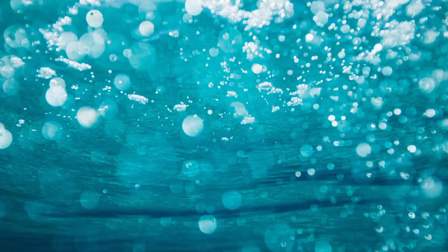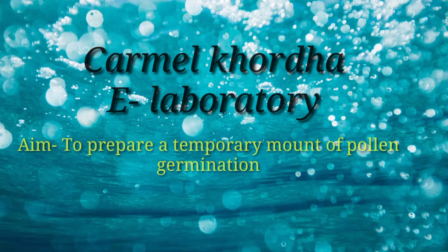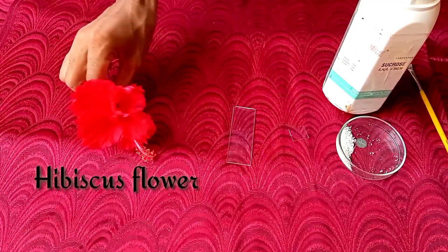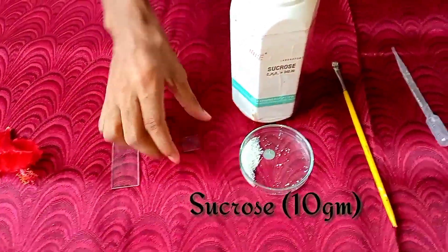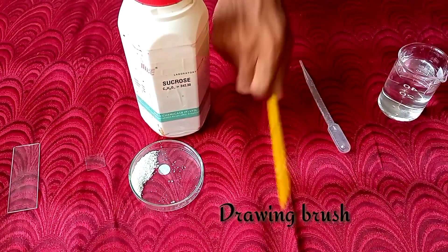Hello friends, welcome to Carmel Khorta e-lab. Today's aim of the experiment is to prepare a temporary mount of pollen germination. Materials required: flowers of cucurbita, hibiscus, or lily; glass slide; cover slip; sucrose of 10 grams; drawing brush; dropper.